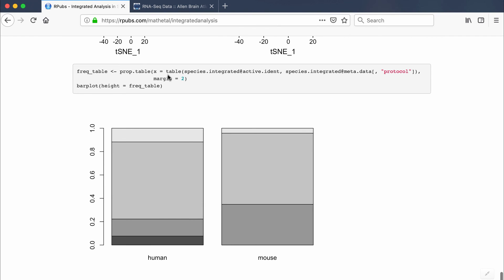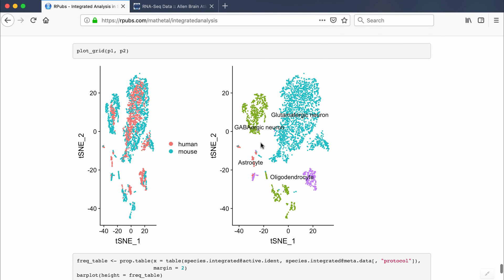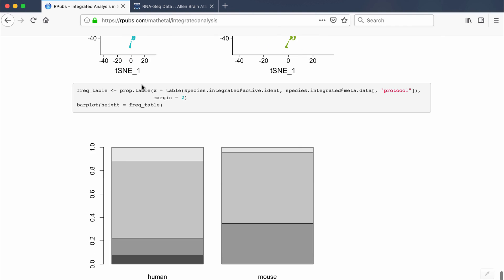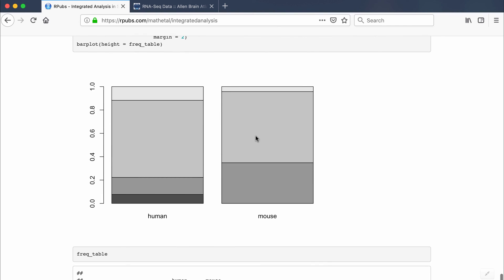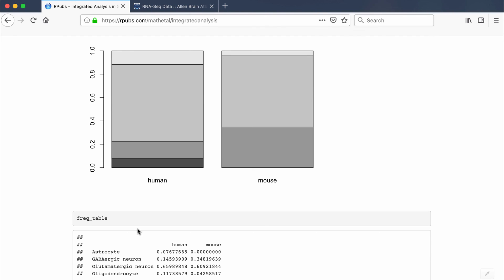In the final part of the code you can create a proportion table or frequency table to compare cell type distributions across species. For example, if you want to know what percentage of glutamatergic neurons are found in humans versus mice, this code will plot those proportions. The mouse only had three cell ID types found. Looking at the results, glutamatergic neuron proportions appear similar between species, and overall there doesn't seem to be a huge difference in cell ID types for this part of the brain.